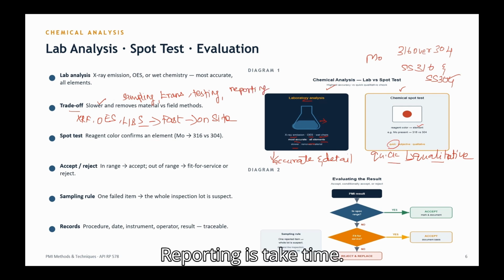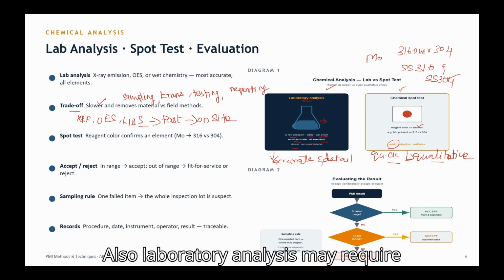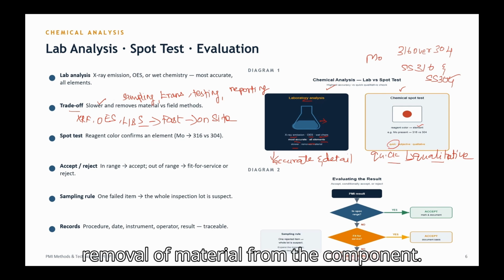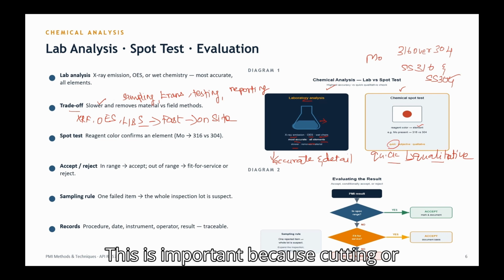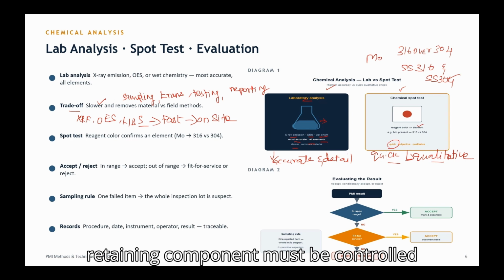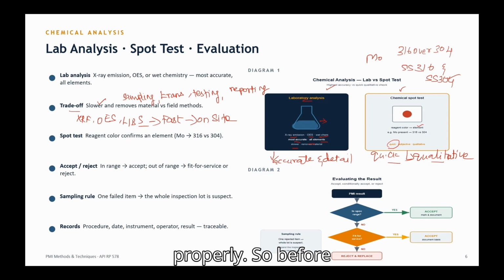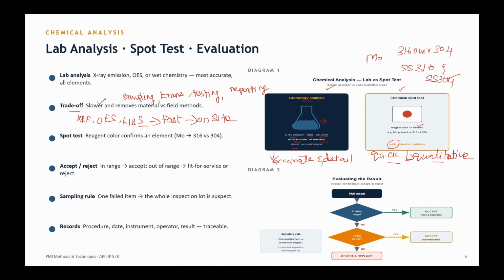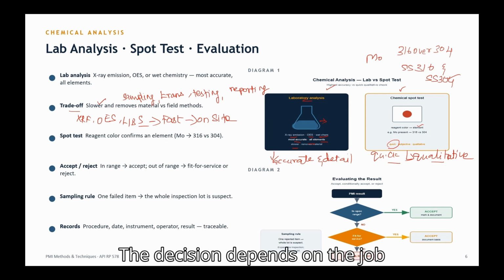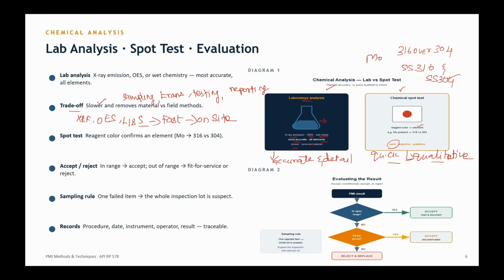It takes time. Also, laboratory analysis may require removal of material from the component. This is important because cutting or grinding a sample from a pressure retaining component must be controlled properly. So, before removing any sample, approval and procedure must be followed. The decision depends on the job requirement, code requirement, client specification, and criticality of the material.